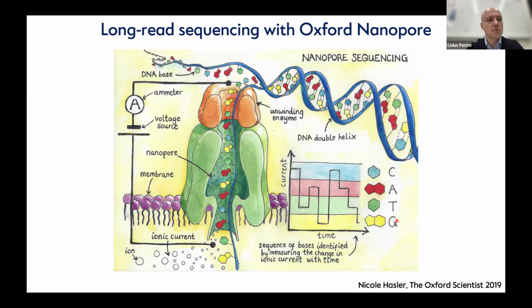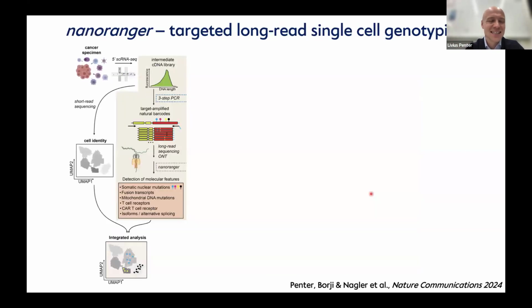And the beauty of this approach is that you could feed very long molecules through this pore and get actually very long molecules read out. And this is something that we thought would be very interesting for trying to understand what is the leukemia in a given single cell data set.